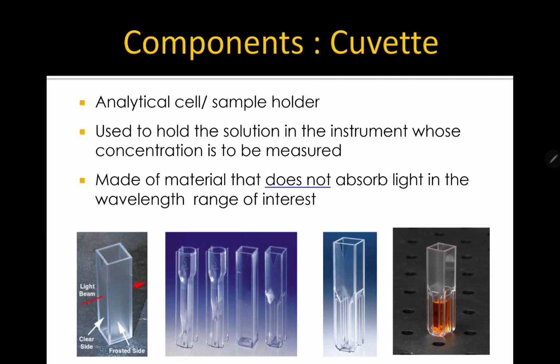So let's continue with our topic in CC1, optical techniques. Our topic for today, we're going to talk about cuvettes. Since we already discussed the components of your spectrophotometer, now we're going to talk about the succeeding parts of this topic. For the components, we use cuvette.